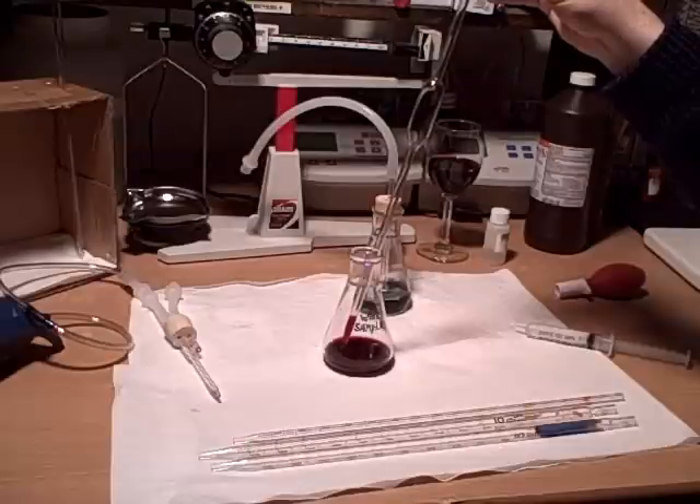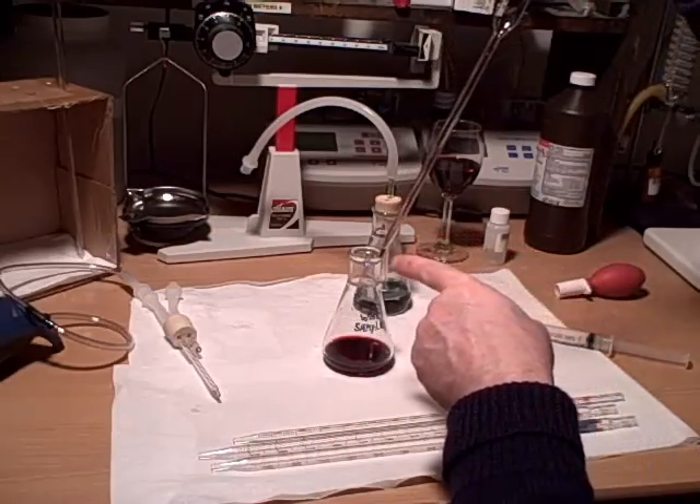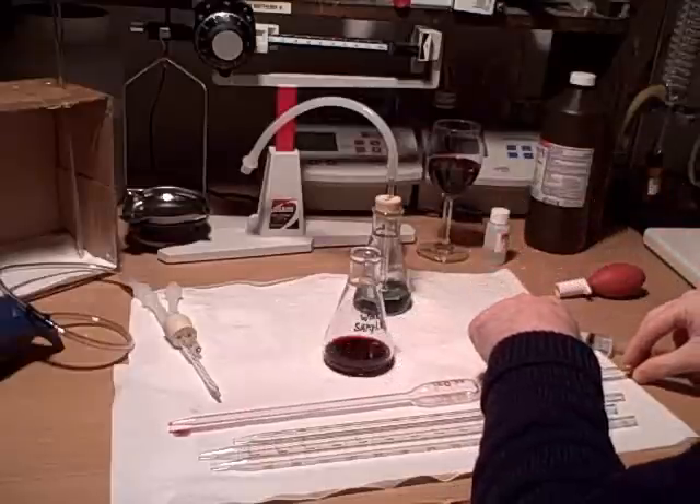All we do is go ahead and pipette 20 mls of wine sample. With the pipette, the little bit that's left over as it's all drained out, just go ahead and leave it — it's still going to deliver your 20 mls like it's supposed to.